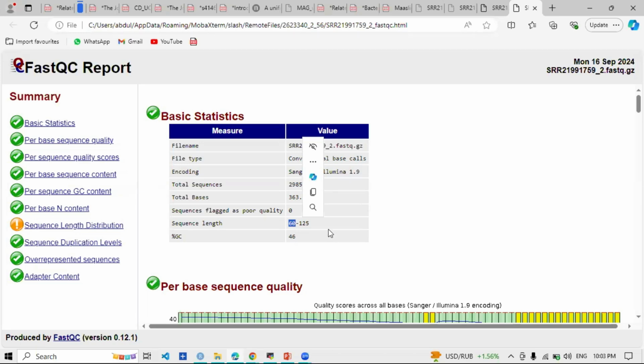Okay, so the larger the read length, the more it will be effectively aligned and the more information will be gathered from it. So we have to eliminate the short reads, the lengths that are in the size of 60. We will start with 70.